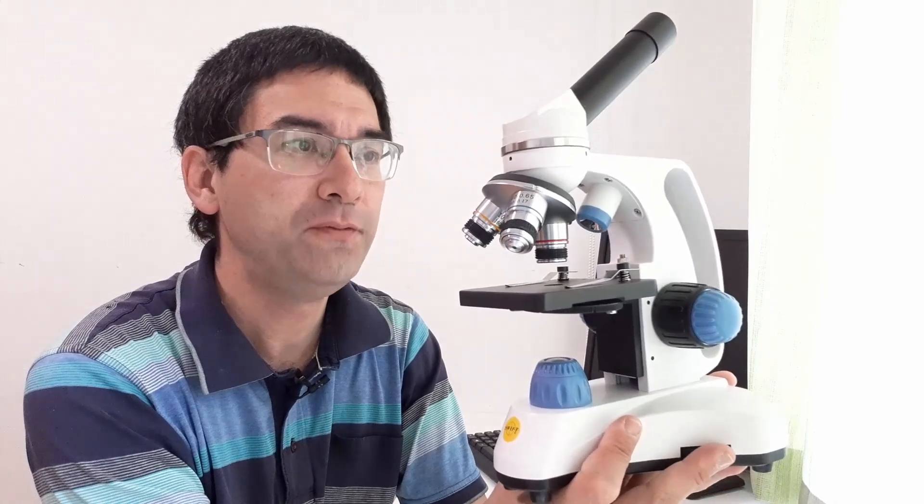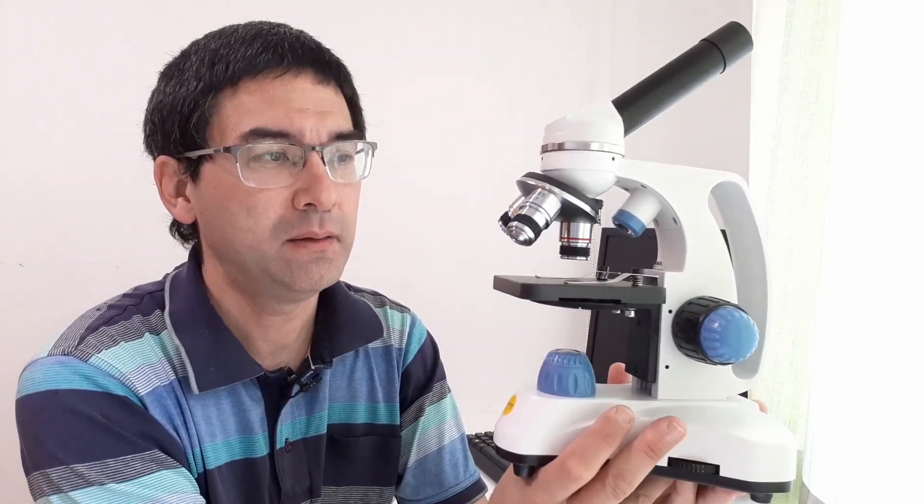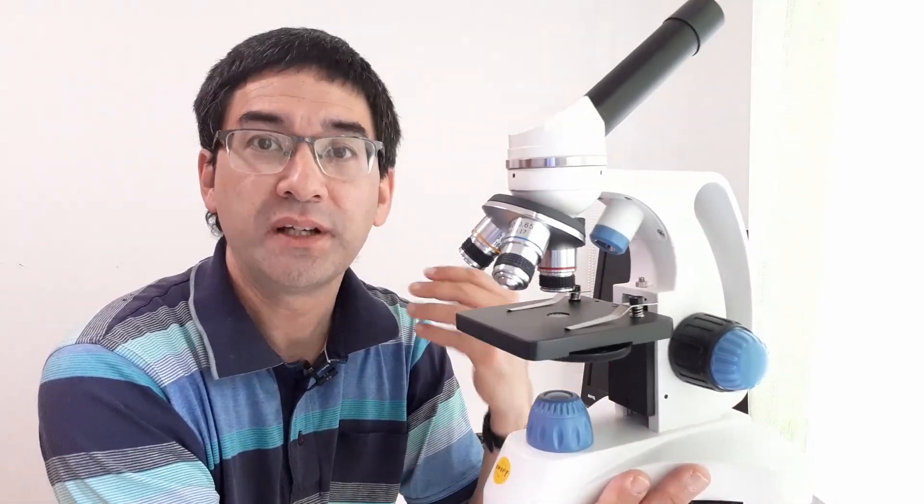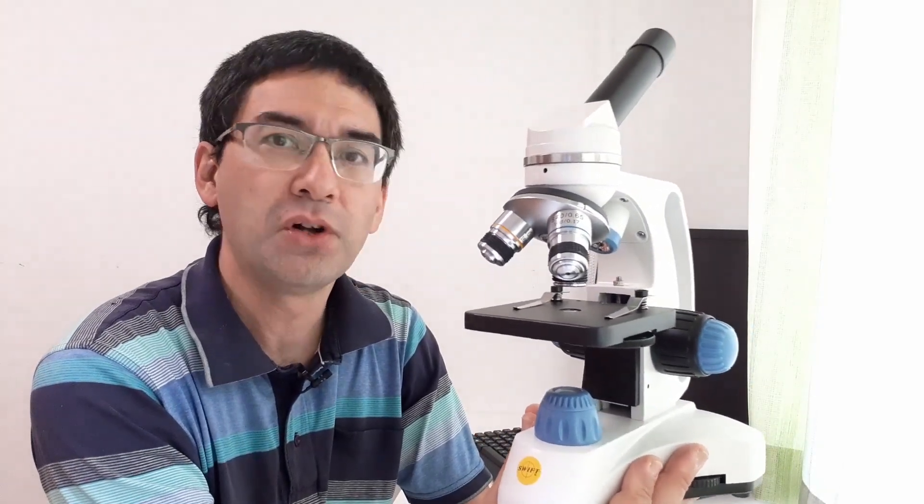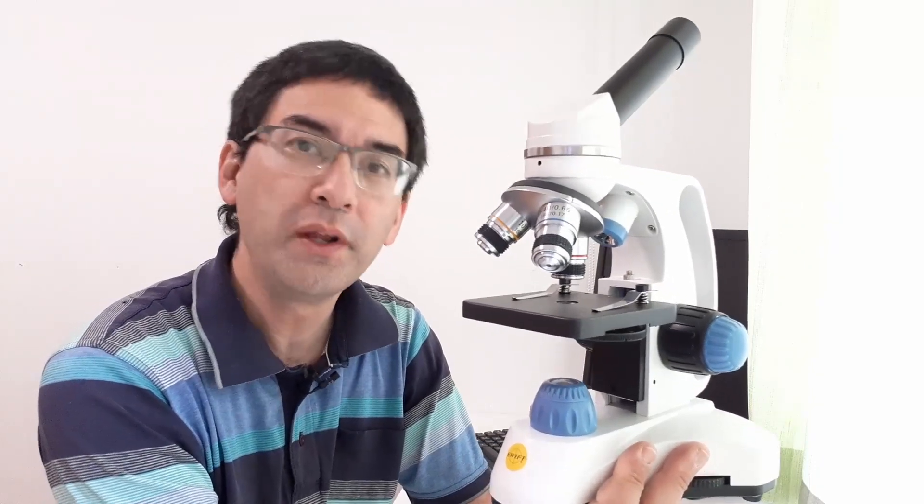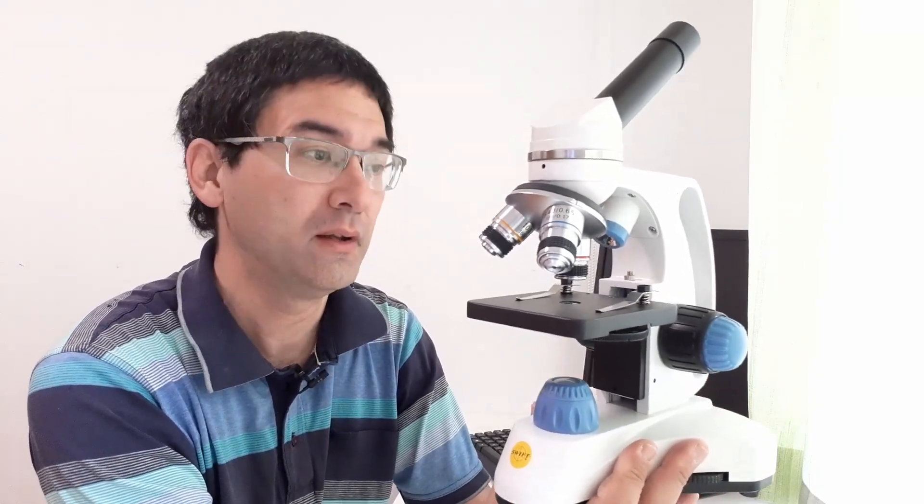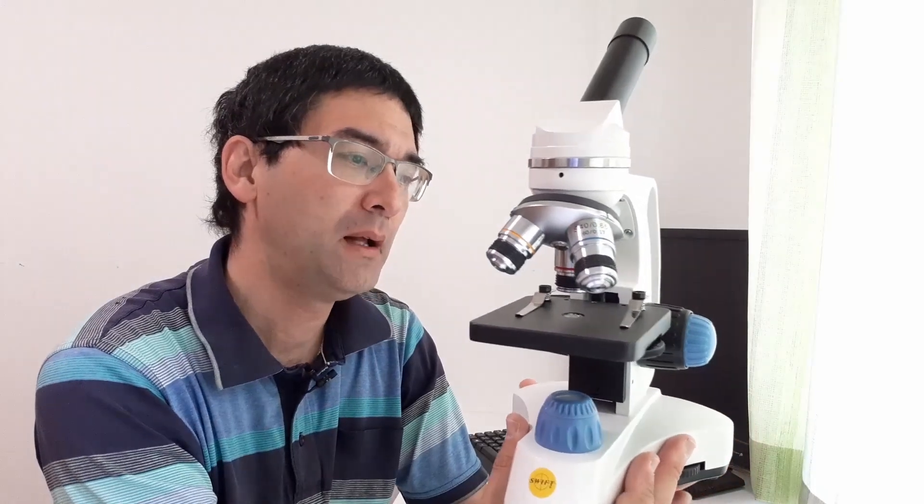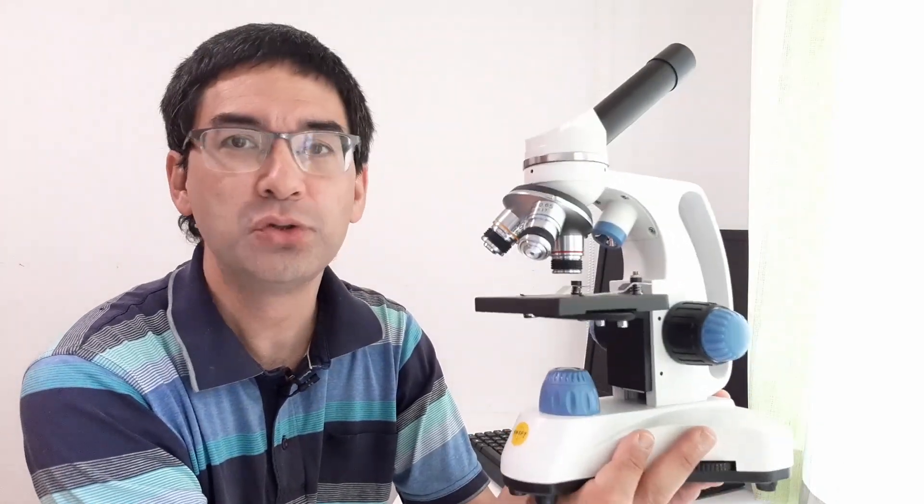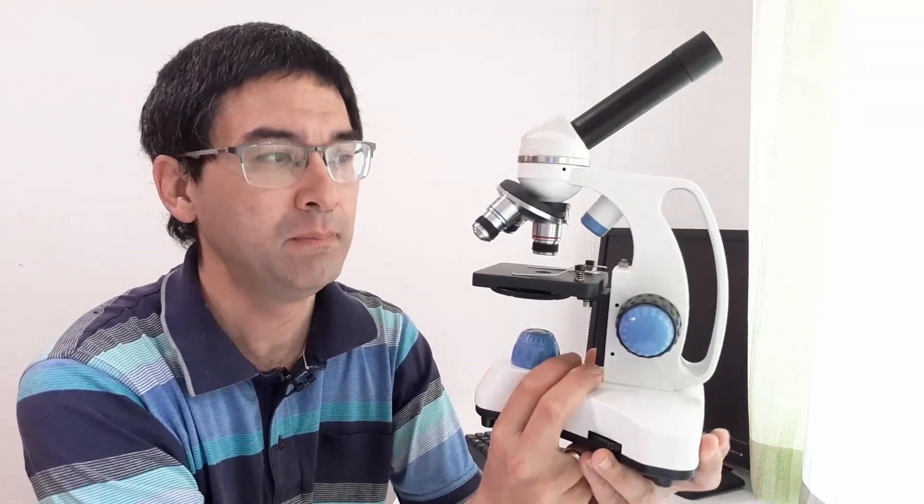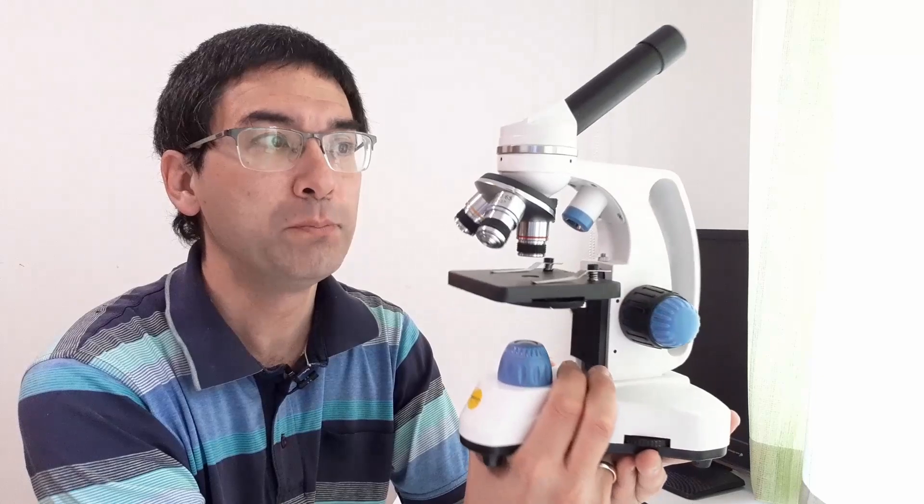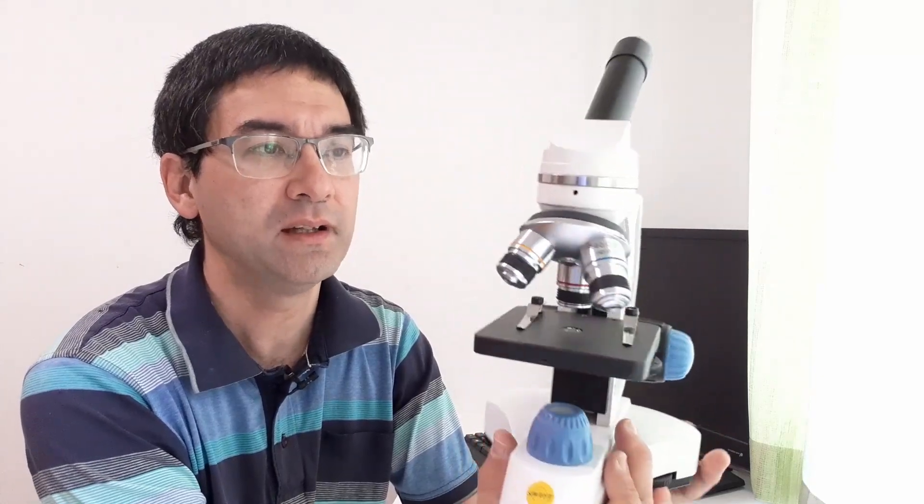First of all, this microscope is called the Swift SW150 and it belongs to the category that I call introductory microscope. I say introductory because I want to distinguish it from the so-called toy microscopes. It's not a toy because simply the image quality is too good and there is a lot of metal. It's made mostly of metal.